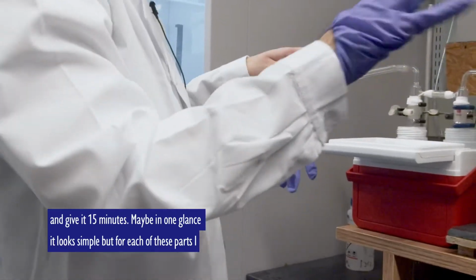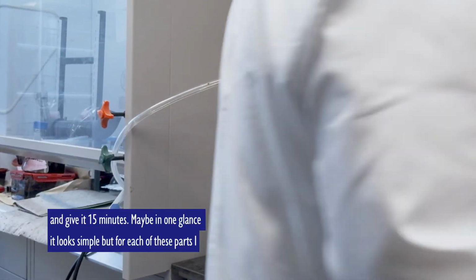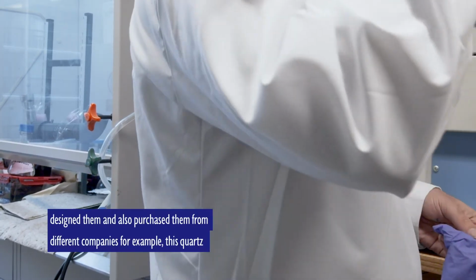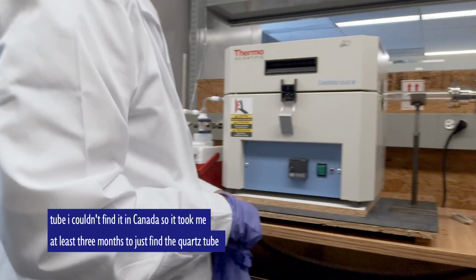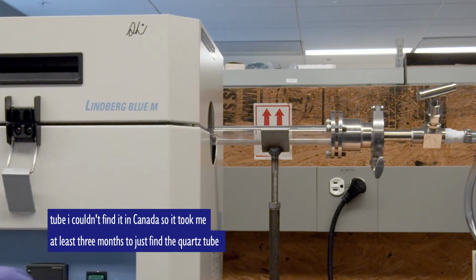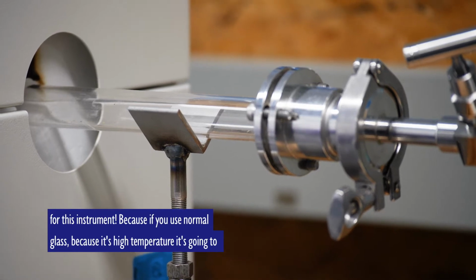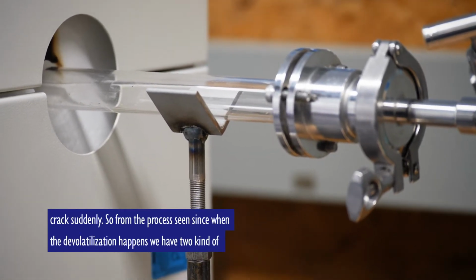Maybe at one glance it looks simple, but for each of these parts, I designed them. And also we purchased them from different companies. For example, this quartz tube, I couldn't find it in Canada. So it took me at least 3 months to just find the quartz tube for this instrument. Because if you use normal glass, because it's high temperature, it's going to crack suddenly.